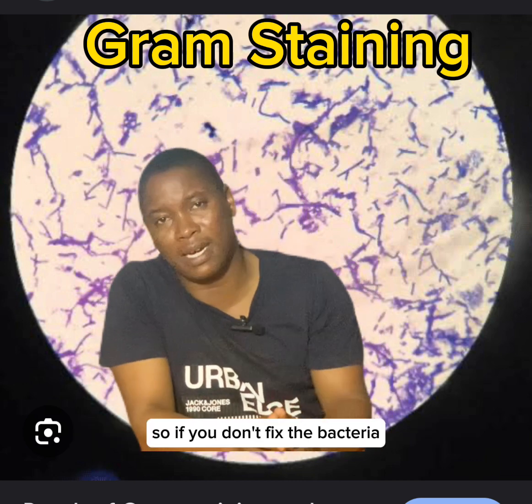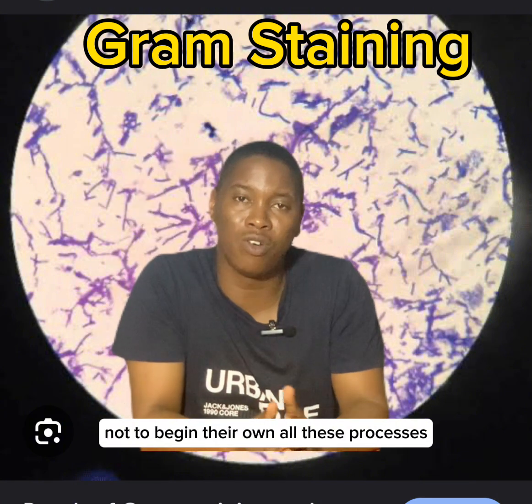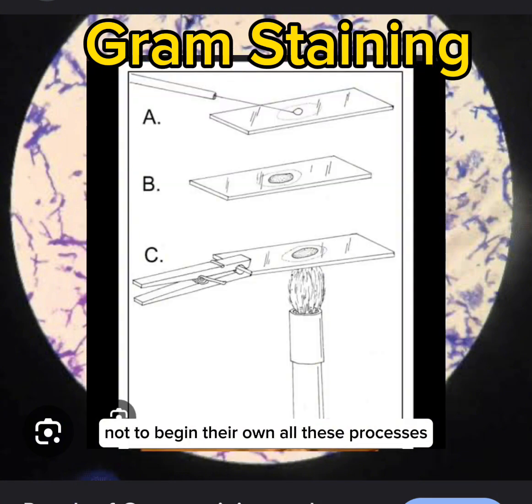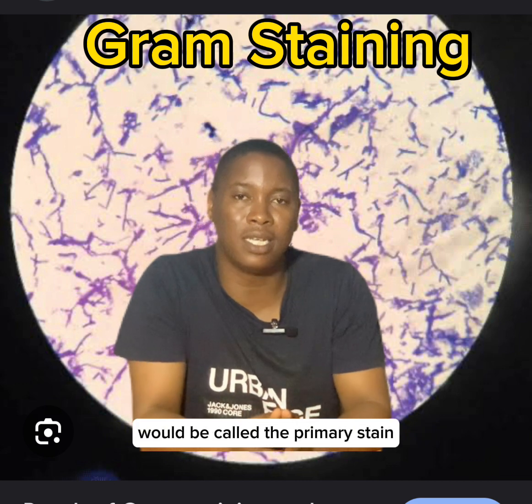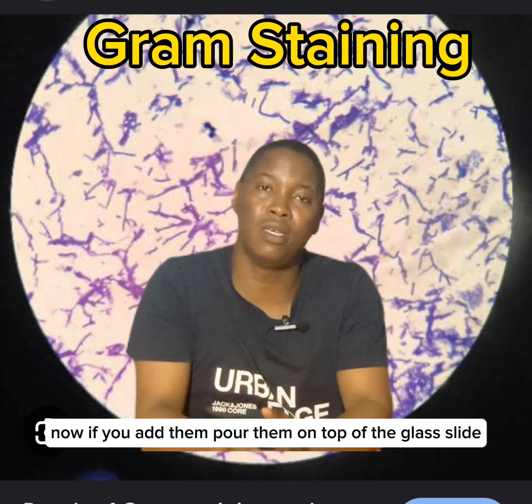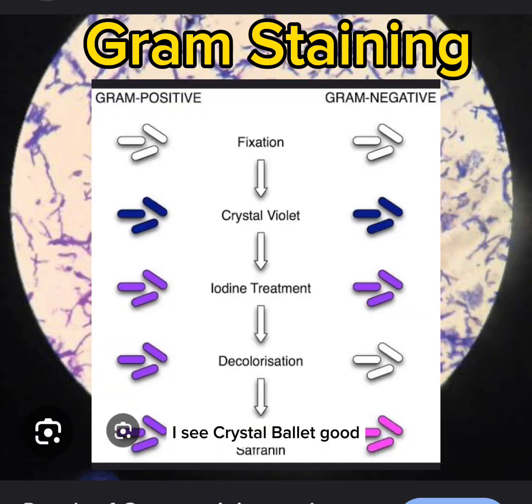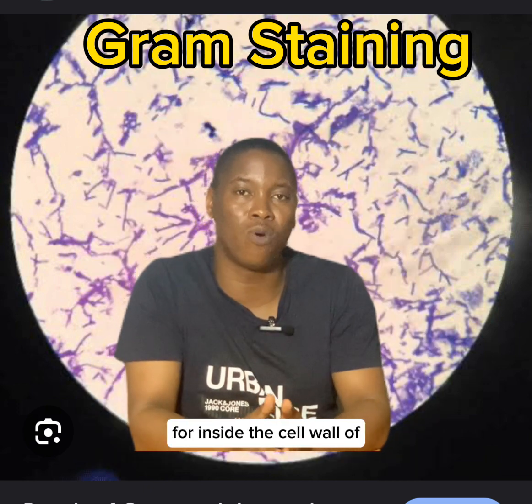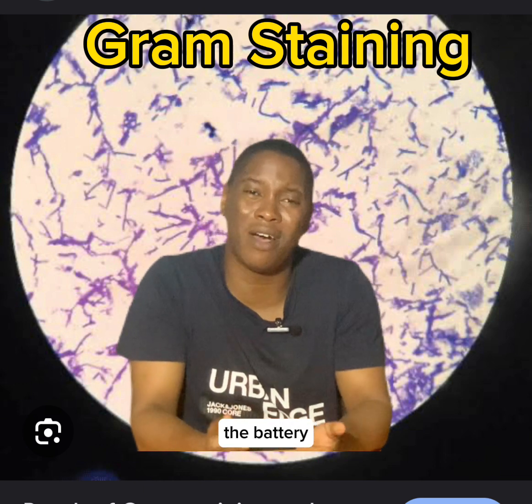So if you don fix the bacteria, either you heat fix am or you air dry am to fix am, the next thing na to begin dey run all these processes. So the first one wey you go do na to add wetin we dey call the primary stain or crystal violet. Crystal violet na the name of the chemical wey we dey call the primary stain. Now, if you add am, pour am on top the glass slide where the bacteria dey, wetin go happen na say the crystal violet go dey react with components wey dey for inside the cell wall of the bacteria. So e go dey there, and that crystal violet, remember say the color na either violet or purple.